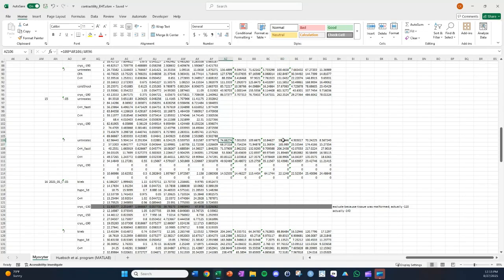And just to give some commentary on this, it's pretty expected for the beats per minute to drop. About 25% is what I typically see. So that's within expected for the controls. Before the treatment, we allow the tissue to compact for 10 days. So about 10 days after the cells are mixed with the fibrinogen and thrombin, we do the experiment. And then we wait another 7 days, and in that 7-day interval, the beats per minute drops by about 25%.